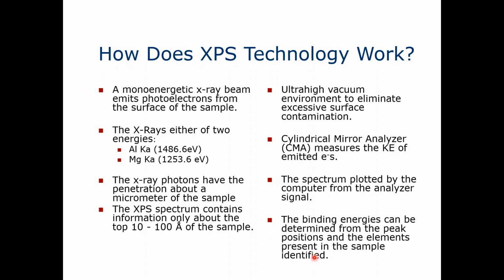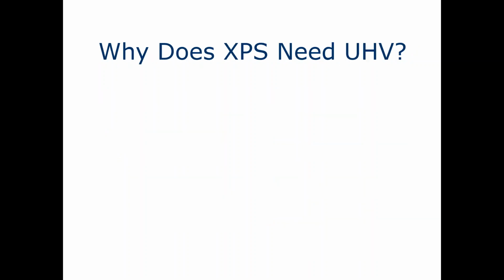As a result of the XPS analysis, we get a typical XPS spectrum that contains peaks. The peaks are positioned at different binding energies, and with that we can identify the elements present in the sample.